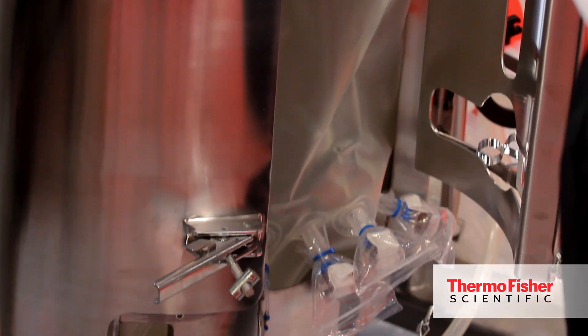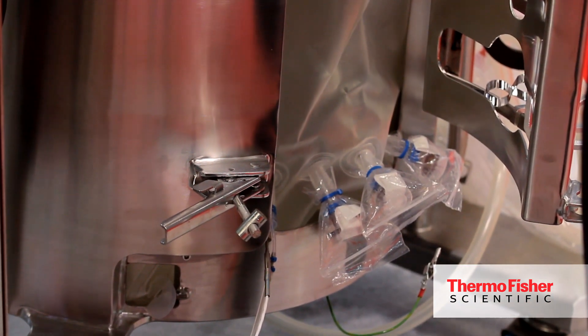We can either put air, or pure oxygen, or a mixture of both — that depends on the oxygen demand of the cells. This helps in growing the cells in a much better way compared to any other environment.